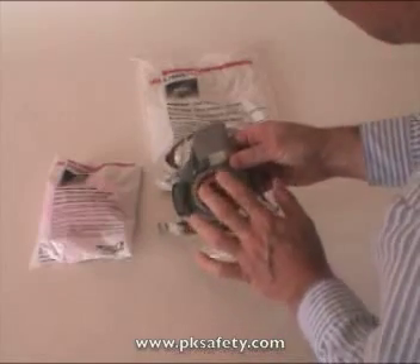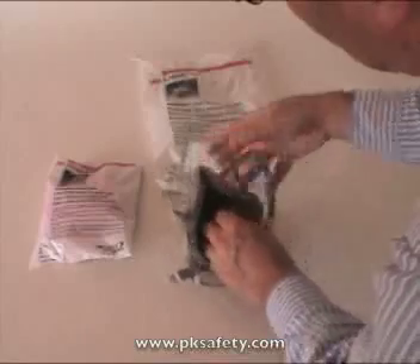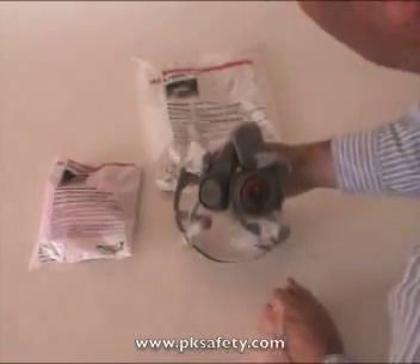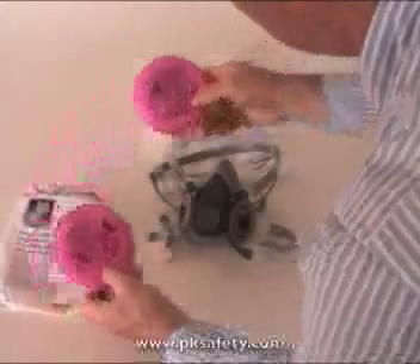The filters are going to go here, and then inside the mask are check valves. These little valves are what keep the air going only inward through the filter and outward through the exhalation valve. The filters that come with the unit are the 3M 2091 — we sometimes call these a pancake filter.